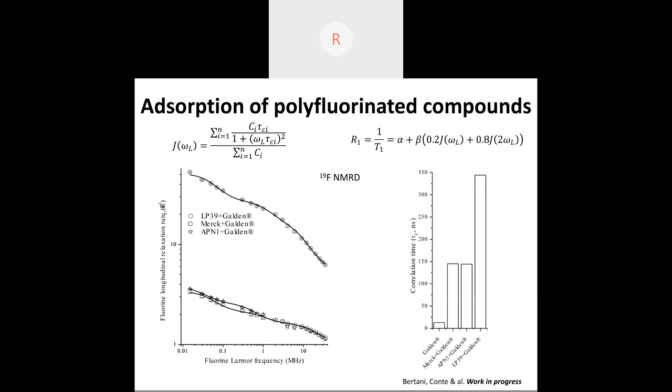This slide shows the 19F NMR profiles of the Galden in equilibrium with these three different solid phases.